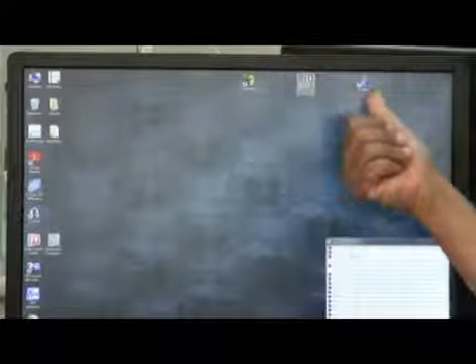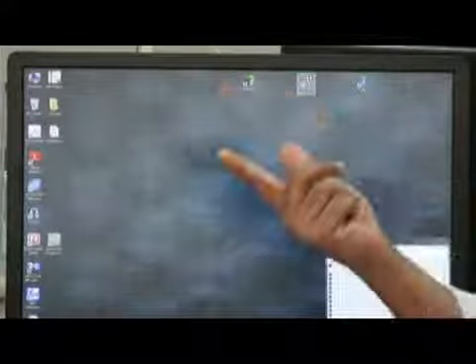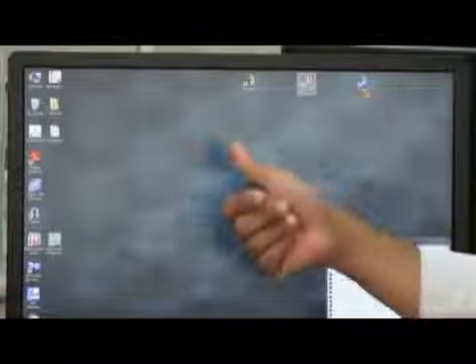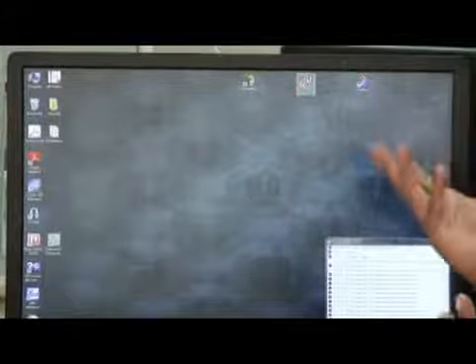Excalibur is not for optimizing the compound. When you optimize the compound and make a tune file, then you use this tune file here to run your injection. This is for routine analysis. Making injections only, then making the quantitation parameters and checking your results. You will see, when we work, which software is for what. Okay?